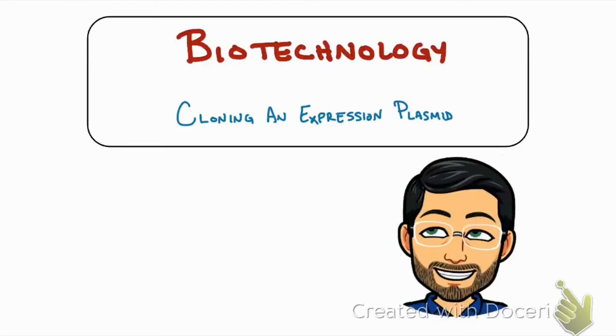In this video, we're going to talk about how to clone an expression plasmid. Our overall theme here is biotechnology, and in the next couple of videos, we're going to talk about the use of biotechnology for biomedical research. One thing to point out, though, is that biotechnology has really become a part of everyday research for anything that's involving cell biology or molecular biology. This also includes microbiological and virological research.